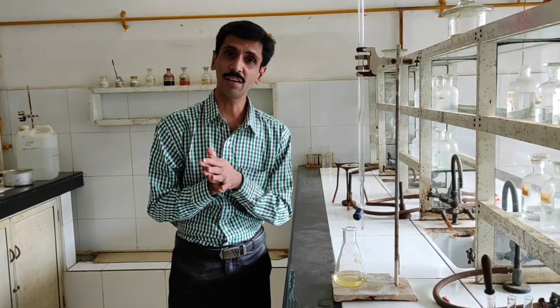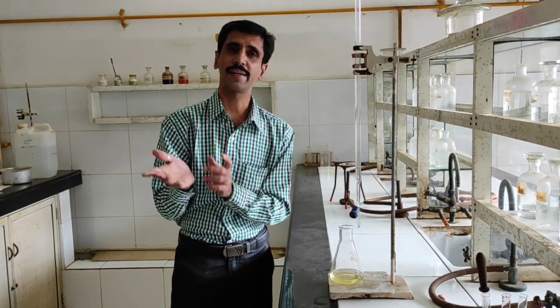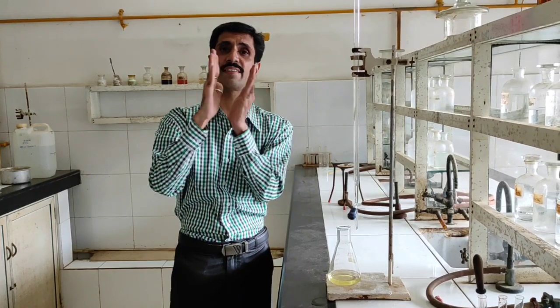So my dear friends, we went for three readings. First one was with respect to our standardization. Alright? That is X1. Second, X2: what was that? Aspirin along with NaOH, and that was titrated against HCl. And this one, X3, was only a blank titration without aspirin, that is NaOH against HCl. So these are the three readings we have, X1, X2 as well as X3.